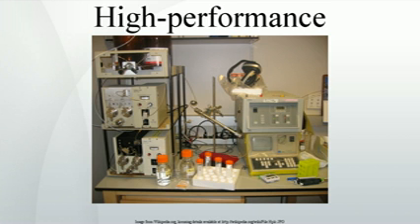Partition chromatography was the first kind of chromatography that chemists developed. The partition coefficient principle has been applied in paper chromatography, thin layer chromatography, gas phase and liquid-liquid applications. The 1952 Nobel Prize in Chemistry was earned by Archer John Porter Martin and Richard Lawrence Millington Synge for their development of the technique, which was used for their separation of amino acids.